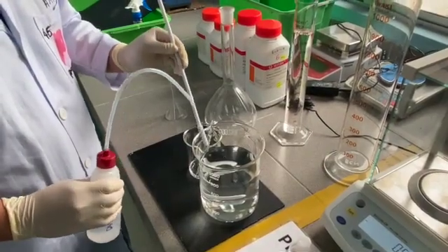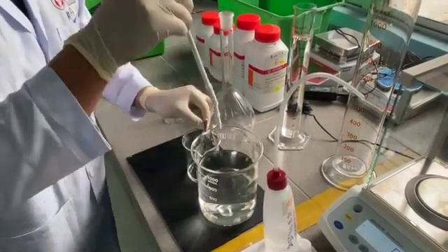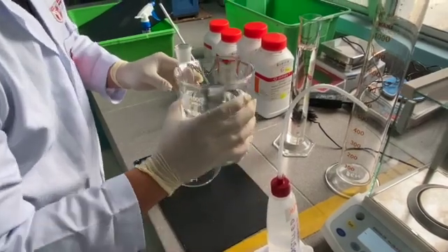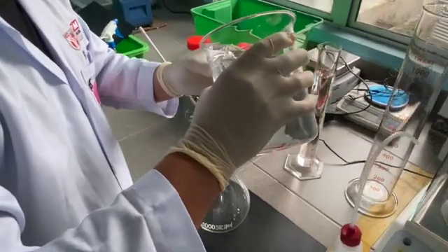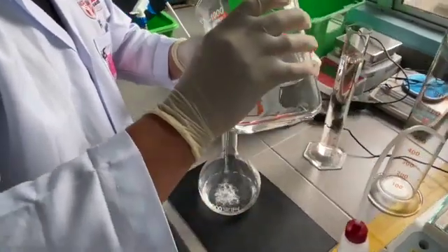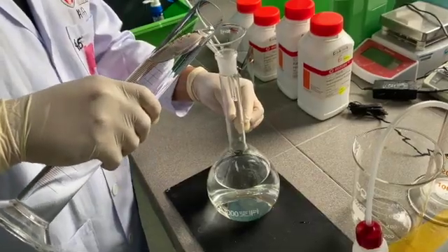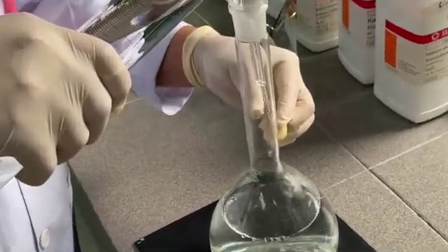We will have to remove the magnetic stirring bar. Once removed, we will have to transfer the remaining solution into a volumetric flask. We will then increase the volume with distilled water until it reaches 1 litre.